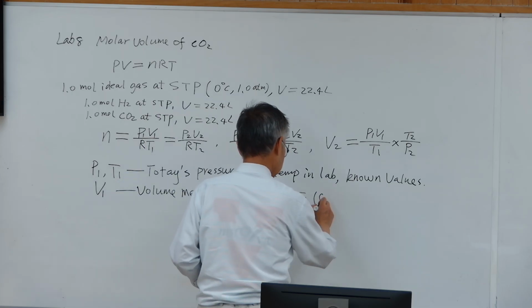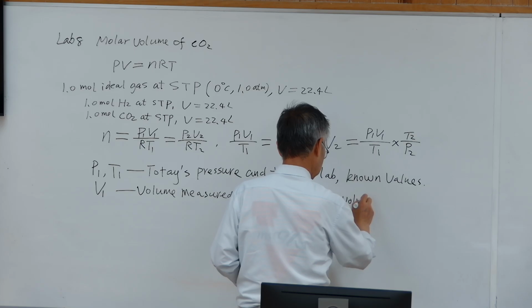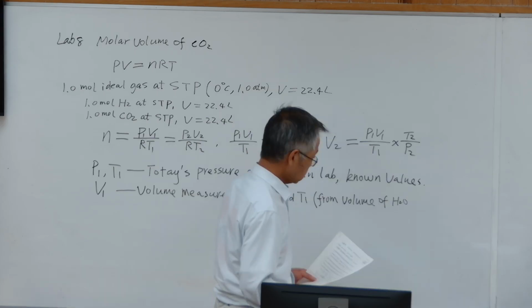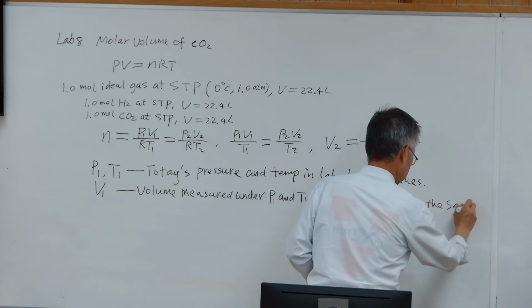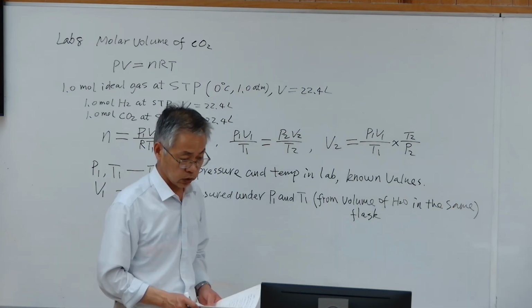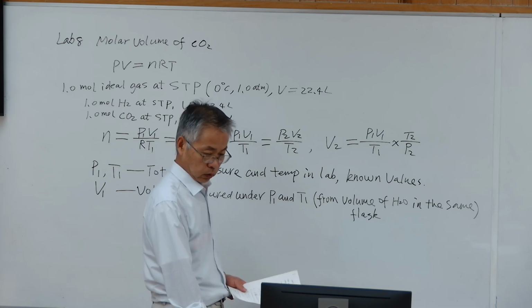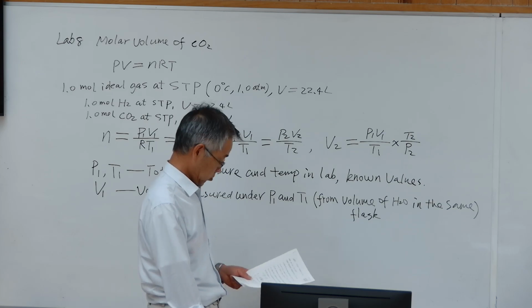Now this volume comes from the volume of water in the same flask. So what is the procedure? The video is on the blackboard, placed in the same place under lab 8.